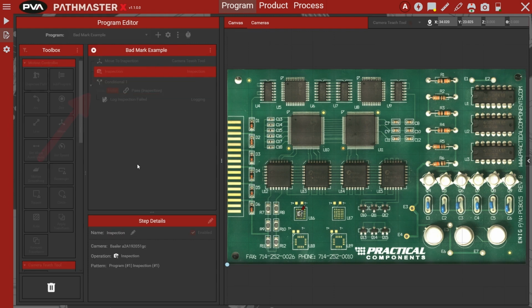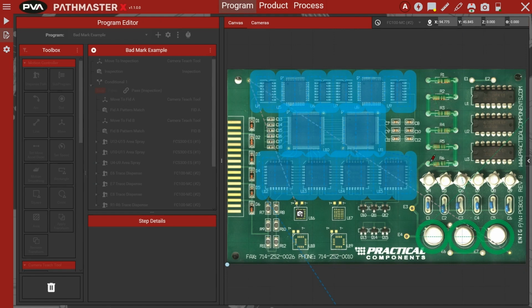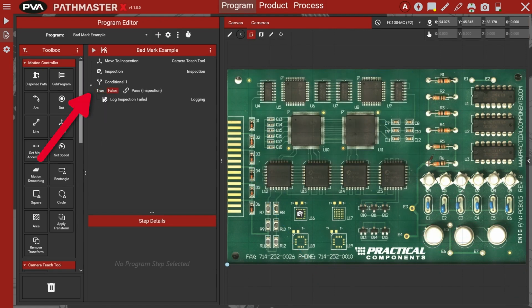Once the step's condition is evaluated, the current value switches to true. When the program ends, the current values of conditional steps are returned to their previous selections.